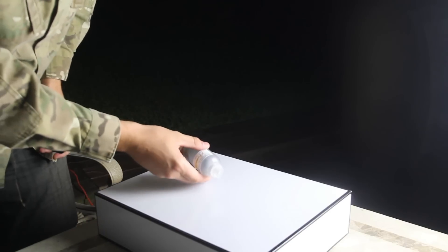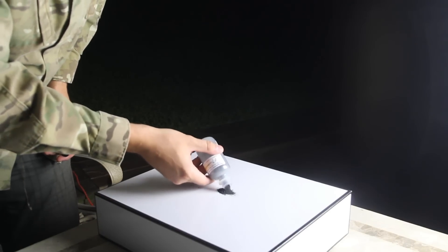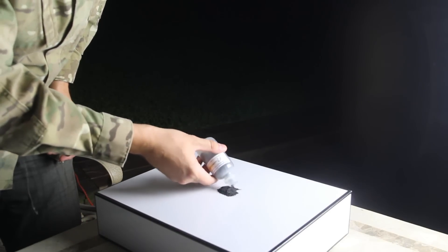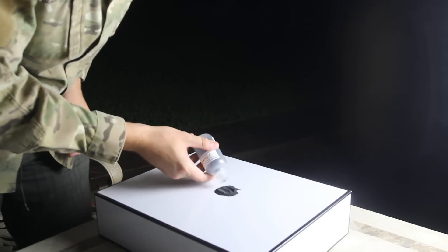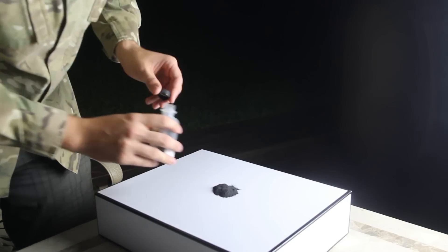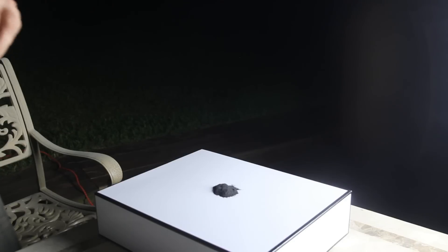For this experiment I'm gonna pour some powder on top of the box right here, just like that — create a small volcano, something like that — and pour 35% peroxide right on top of it and let's see what happens.